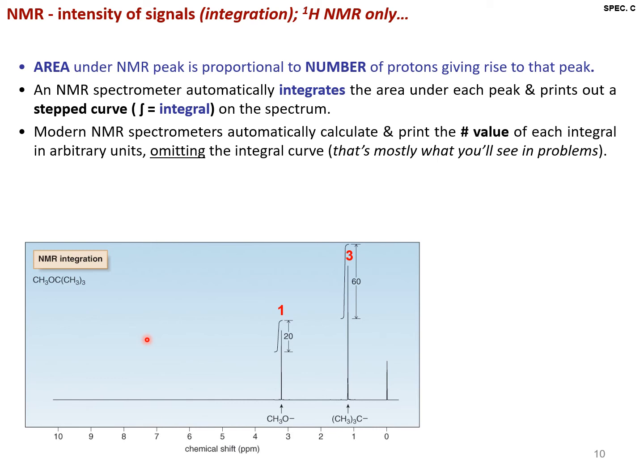And in modern instruments, the stair step is usually omitted, and the number will appear only. Your textbook does have a few problems with the stair steps, which is why I'm showing you this. But normally you're going to be given problems where the numbers are going to be either written directly above the peak or written underneath the peaks, the integral values.